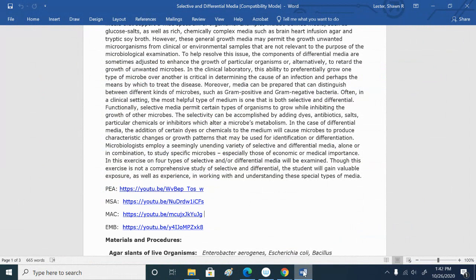We don't use Yersinia because that causes bubonic plague. And the other ones listed there, we don't use either. Salmonella, because, food poisoning, it's a pathogen. And so we have our own gram-negative rods that are lactose negative that we use, but not all the ones that she showed.